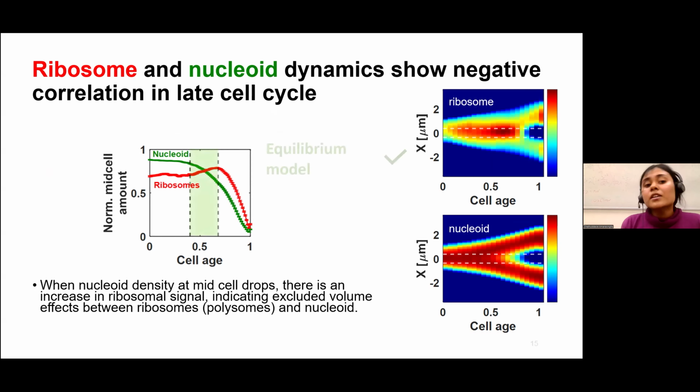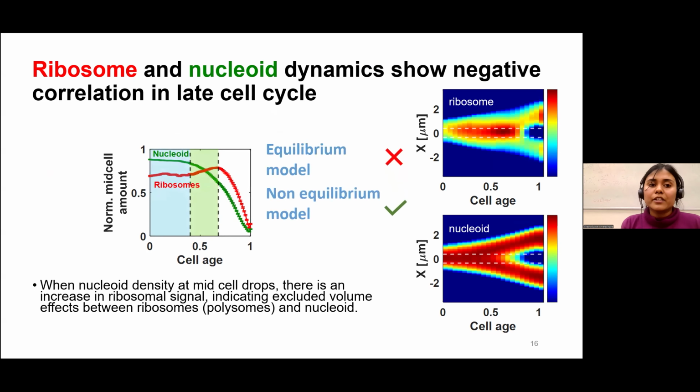And this region, where ribosomal signal goes up and the nucleoid signal goes down, is consistent with the equilibrium model. However, in the early cell cycle, the period where both species prefer mid-cell is only consistent with the non-equilibrium model. As different periods in the cell cycle show varying dynamics between DNA and ribosomes, it is essential to test polysome-driven nucleoid separation in different periods of the cell cycle separately.